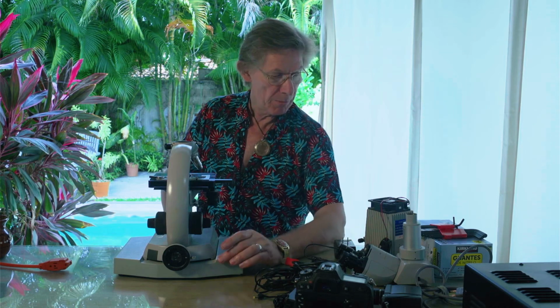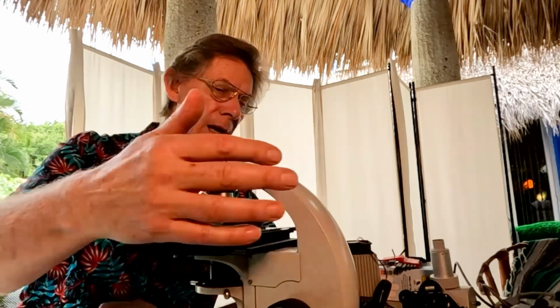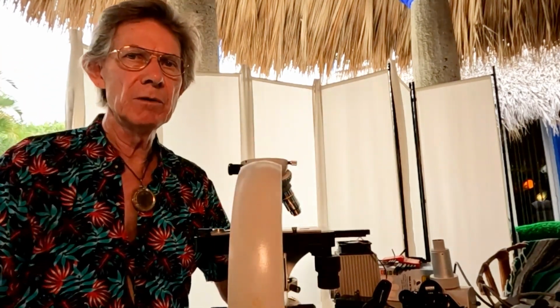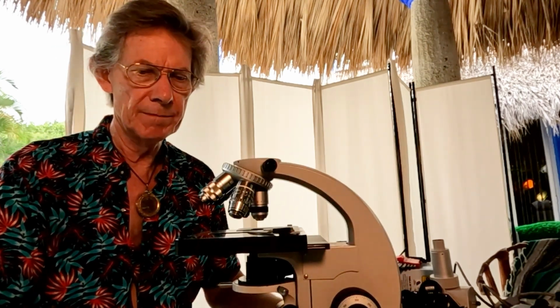So we have to look at it through a microscope. A microscope has a number of different parts, which we will go through as we assemble this unit. The base of the microscope, which is what we see here, and the body of the microscope. I'm going to turn it a little bit so we have a better view of it. Actually, we can do that here.